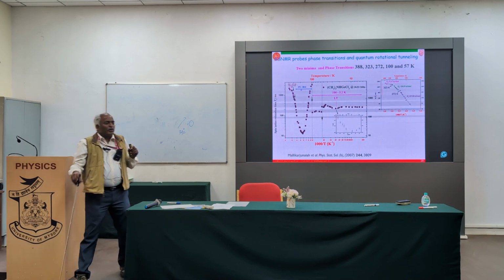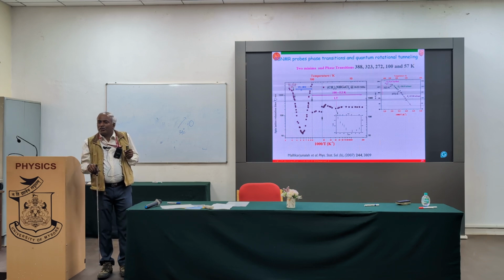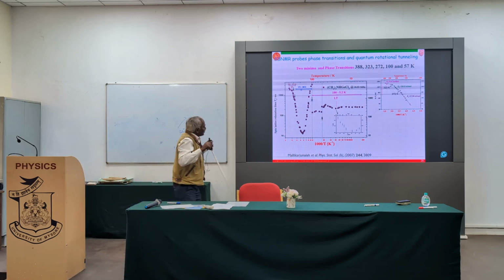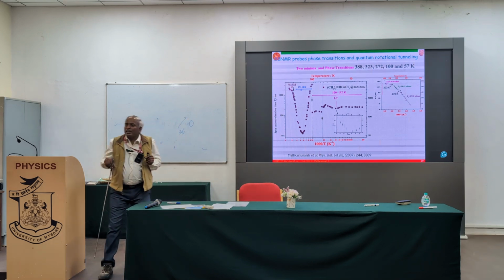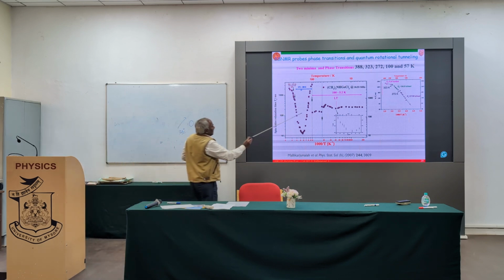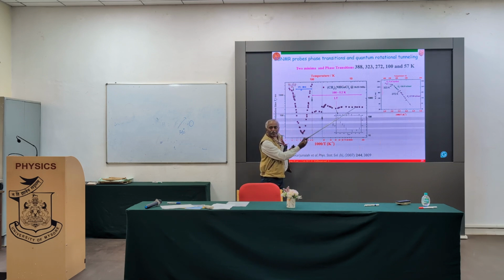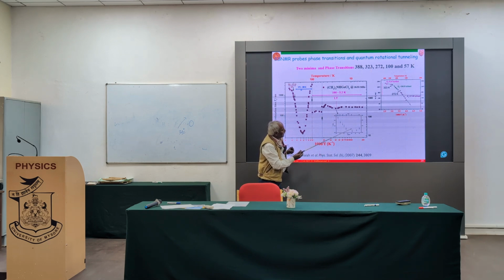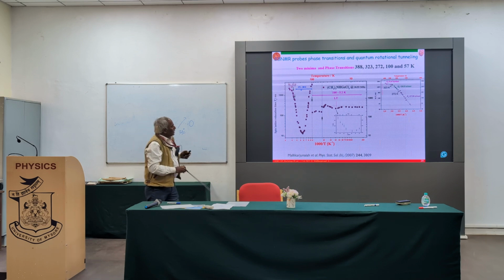Don't think that an error bar makes people not believe you. They appreciate it. But more information is there in the fluctuation, not in the straight line. That information we could have neglected here. It is almost the same, is it not? Whenever you look at this complete spectrum, you always feel that it is almost the same. Even if this point would have been here, even then this point would have been here. It's a clear minimum, one can see that.